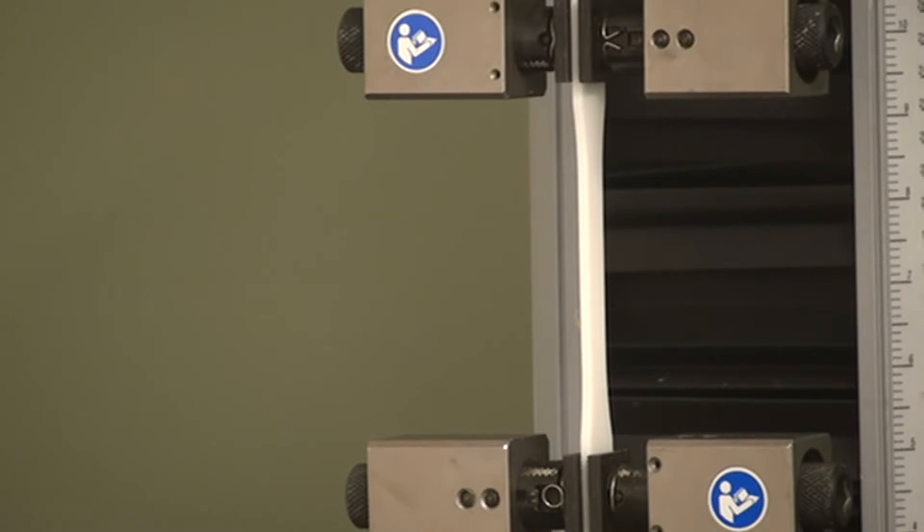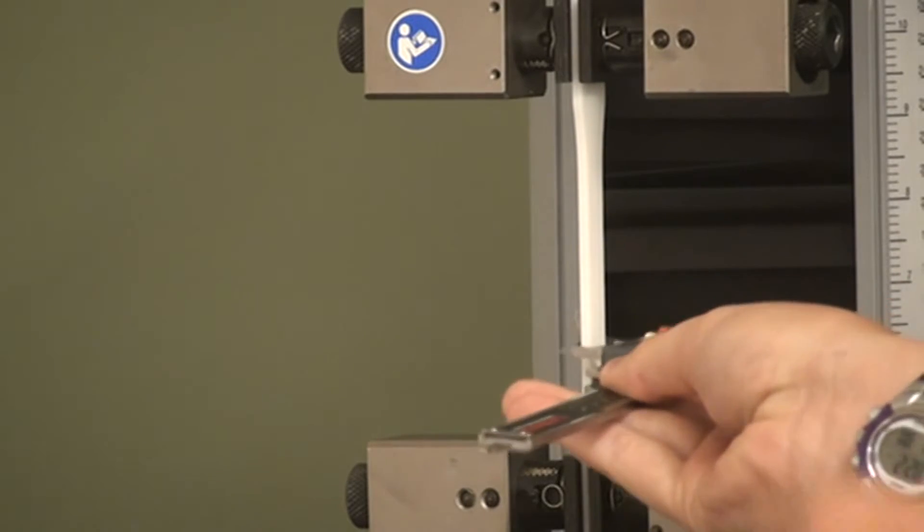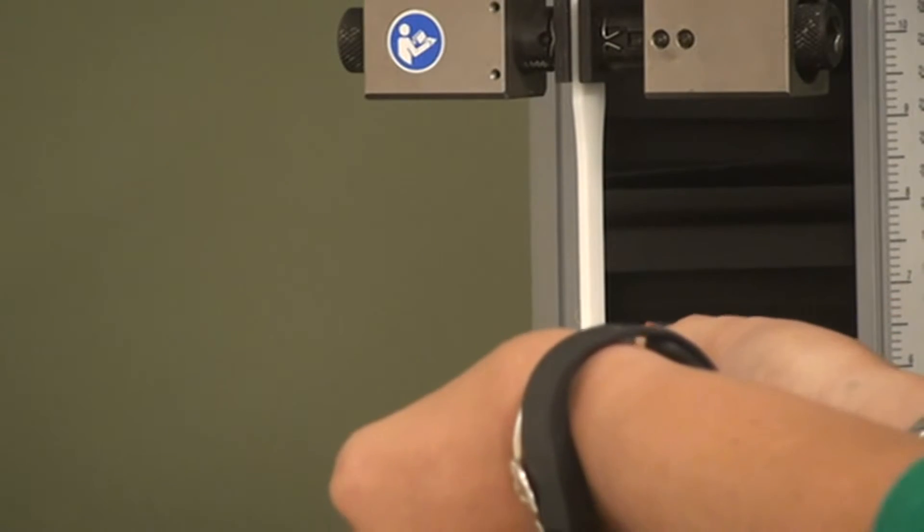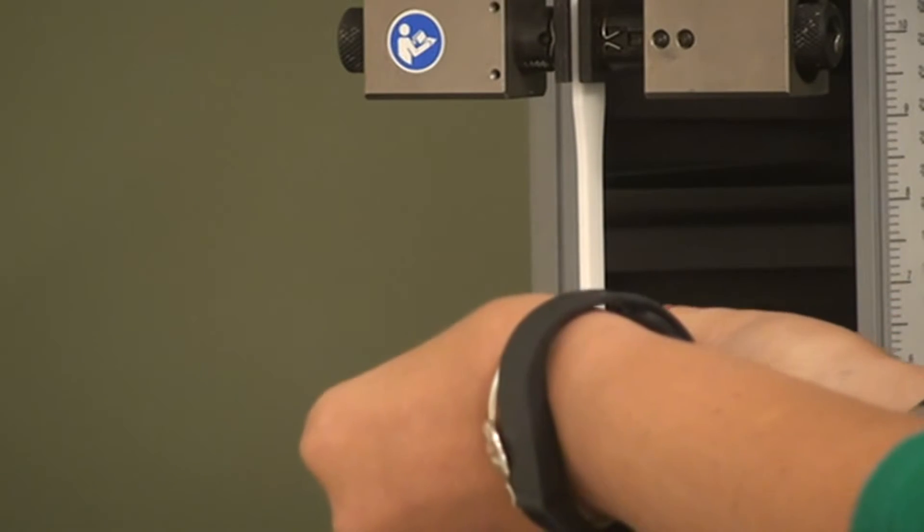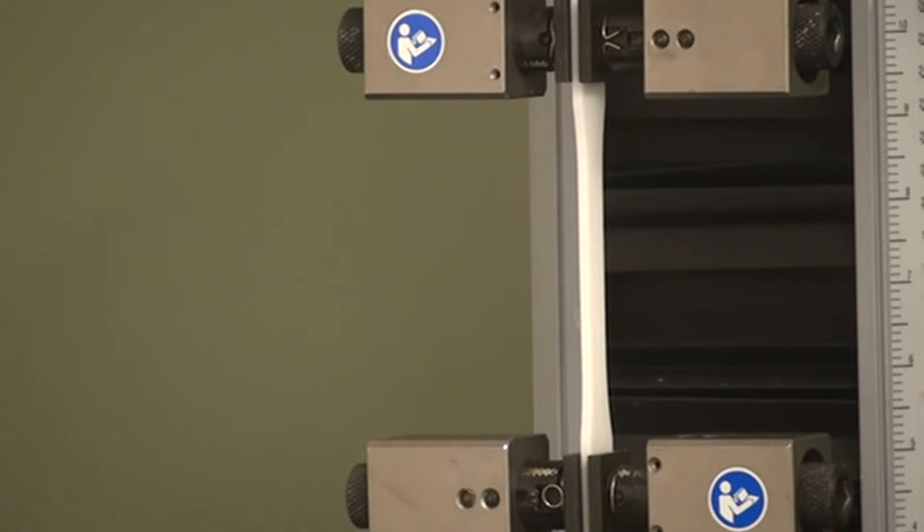To measure the width of the sample, put the calipers around, pull back, and record the measurement.